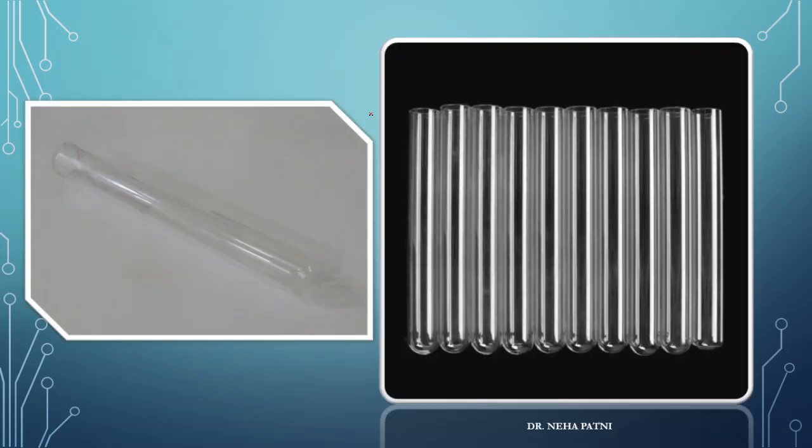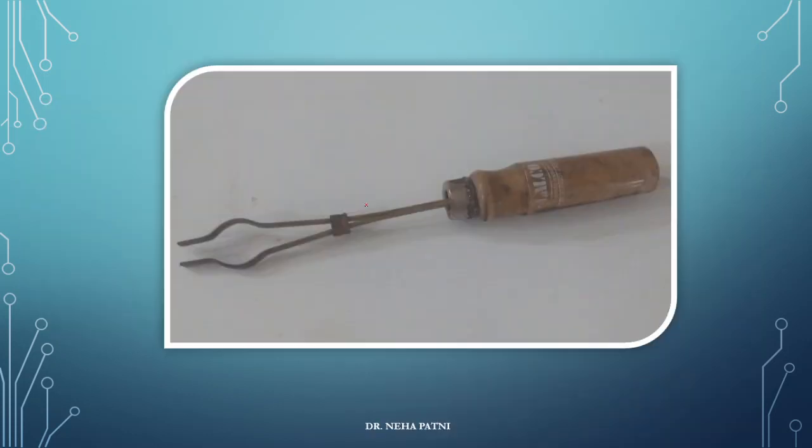This is a test tube, already covered. Now related to that test tube — this is the portion wherein you can keep your test tube. This is nothing but a test tube holder. This is the switch: you can take it this way and it will become tight, and if you take it back it will become loose. That is how it holds a test tube.